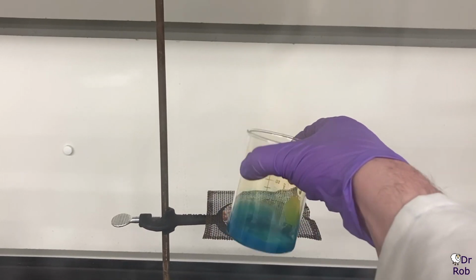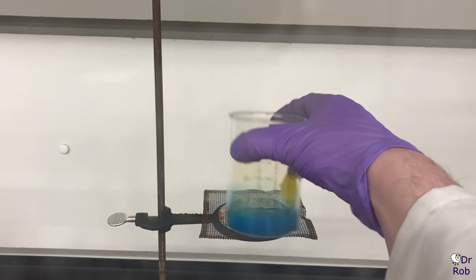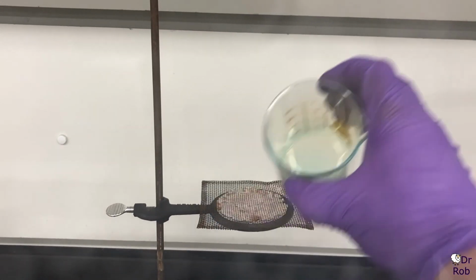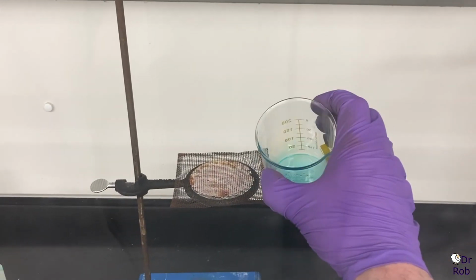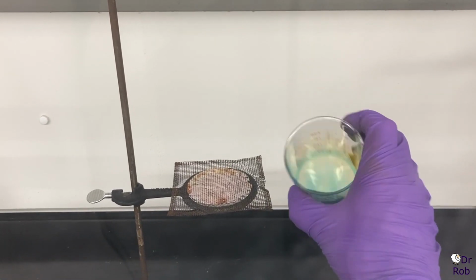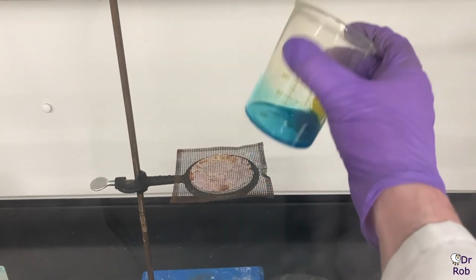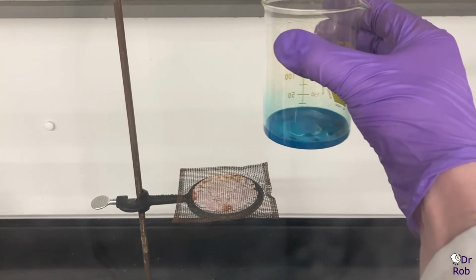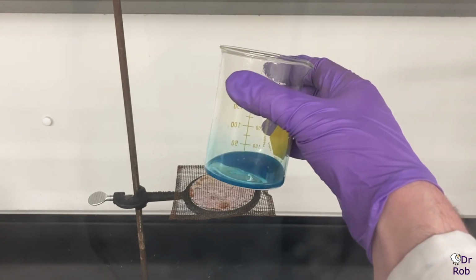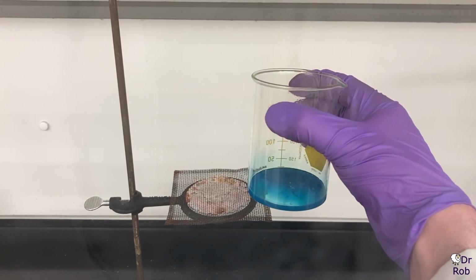So you see as I swirl it a lot here, you can see some of the brown gas coming out still. That's why you're going to want to swirl it. When I have students do this, if we have time, I have them do this first, and then as they prepare all the other solutions that they're going to need to conduct the experiment, we just let it sit. So it sits for like 20 or 30 minutes, depending on the student and how quickly they get done with the other stuff, and that's generally enough time, and you don't usually have to swirl it at that point. But here, trying to get it done in just a few minutes, you're definitely going to want to swirl it quite a lot.